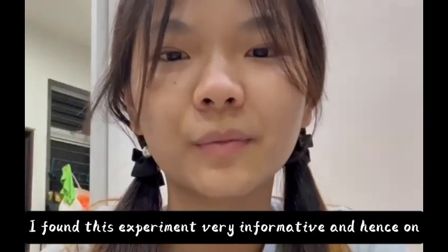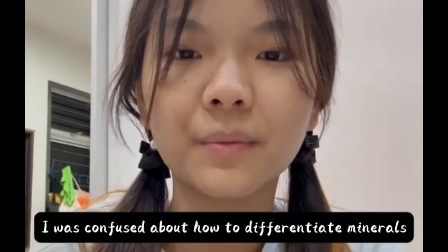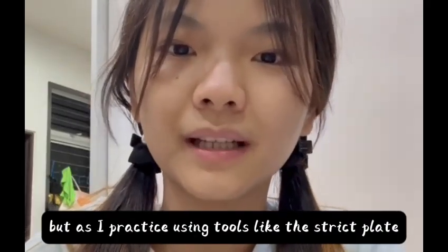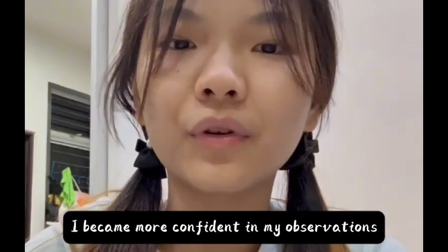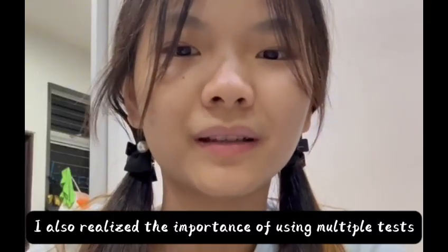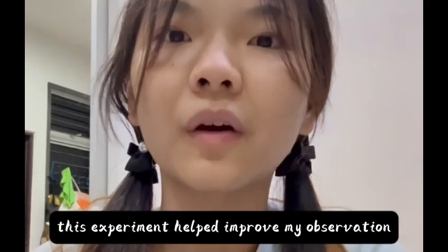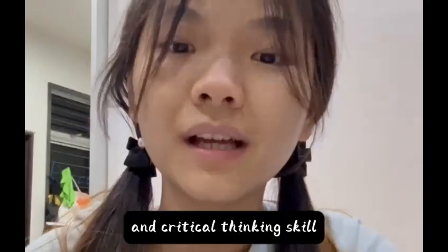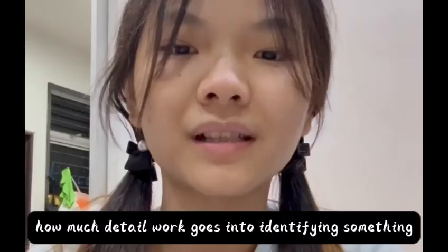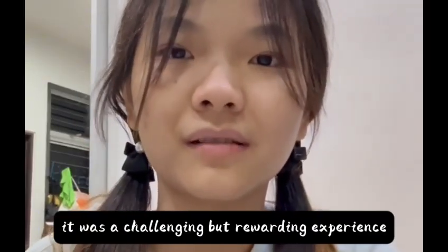Personally, I found this experiment very informative and hands-on. At first, I was confused about how to differentiate minerals that look very similar. But as I practiced using tools like the streak plate and Mohs hardness scale, I became more confident in my observations. I also realized the importance of using multiple tests rather than relying on just one property. This experiment helped improve my observation and critical thinking skills, and now I appreciate how much detailed work goes into identifying something like a rock or mineral. It was a challenging but rewarding experience.